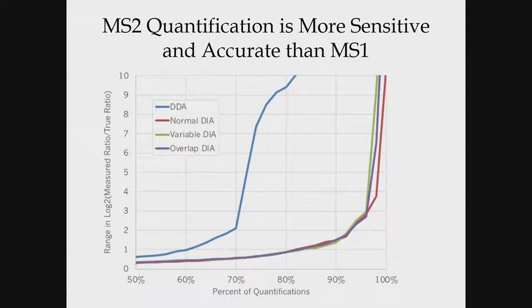The MS1 quant, especially on orbitrap data, has significant limitations as far as the dynamic range, mostly because of what people call the space charge limits in the orbitraps. You can only put 1 million charges or 500,000 charges in the instrument. So if you've got a lot of things when you measure data-independent acquisition, we're filling that same number of ions over a narrower mass range.